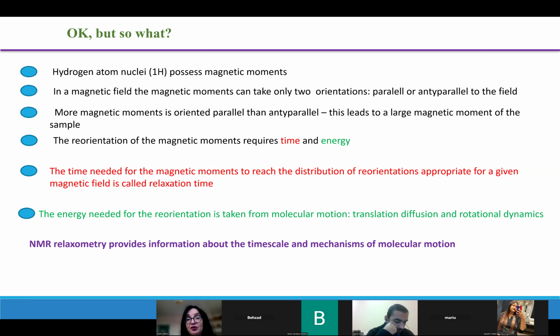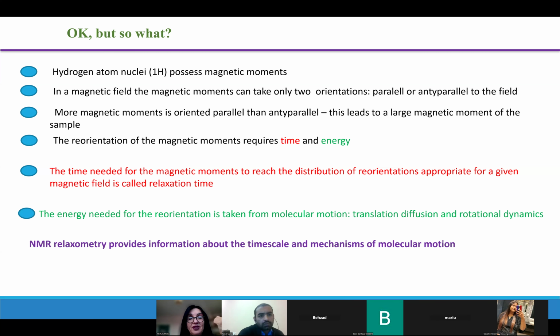With other protons in the surrounding. It does not matter to what molecules they belong. They do not need to belong to different molecules. But the question is, what is the communication channel? The way they bond. How they see each other. Bond how? After all, there is no string between them.